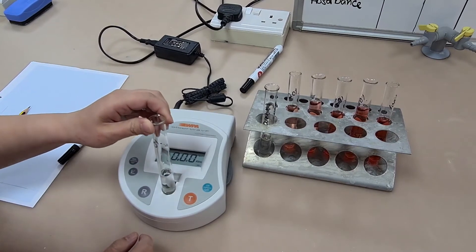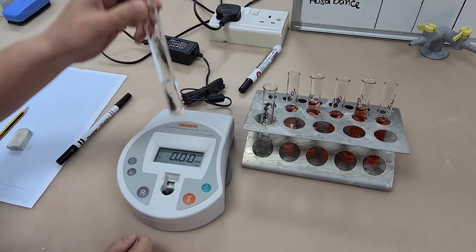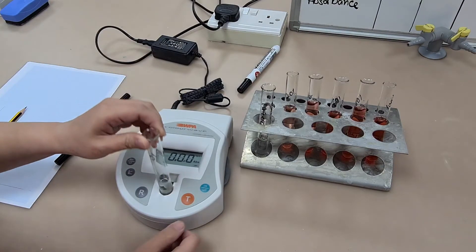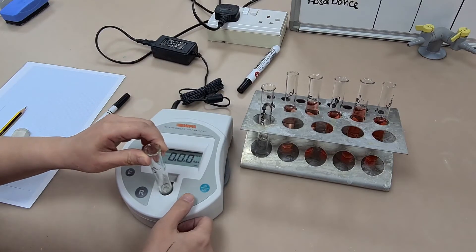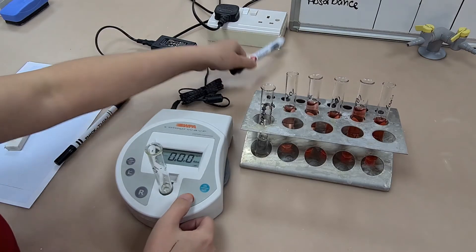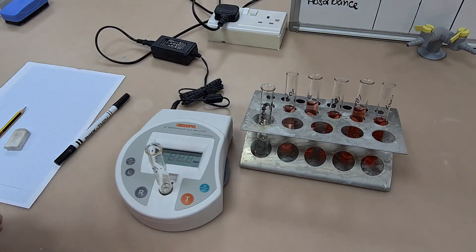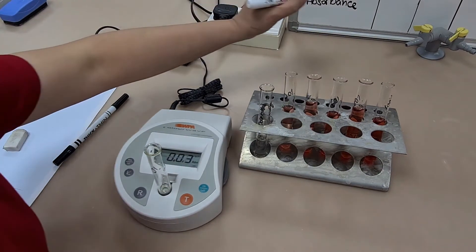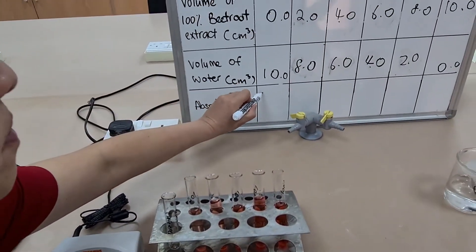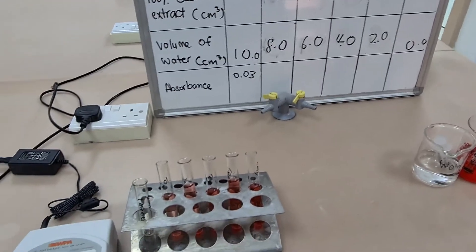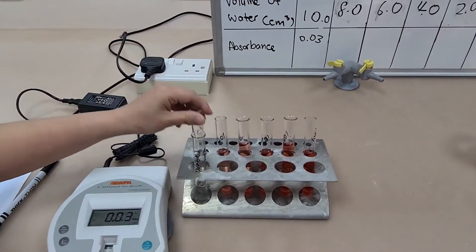So now I've tared my colorimeter I can start testing my samples. All I need to do is make sure that the sample is deep enough in the test tube that the light will actually pass through the sample. And you can see I get a reading of 0.3. And I'm going to record that down in my table that I made earlier when I worked with my dilution series for my beetroot extract.